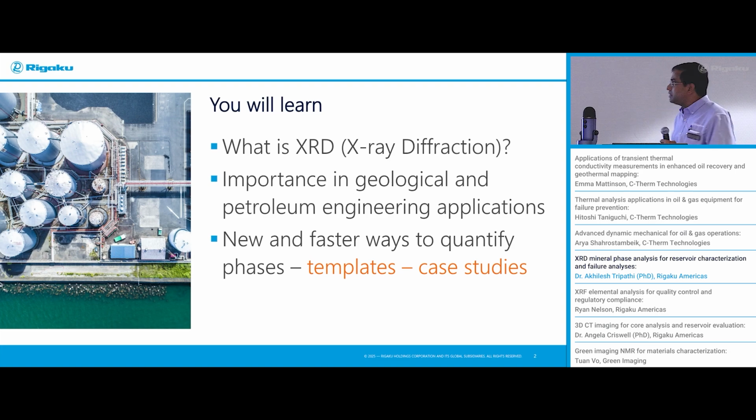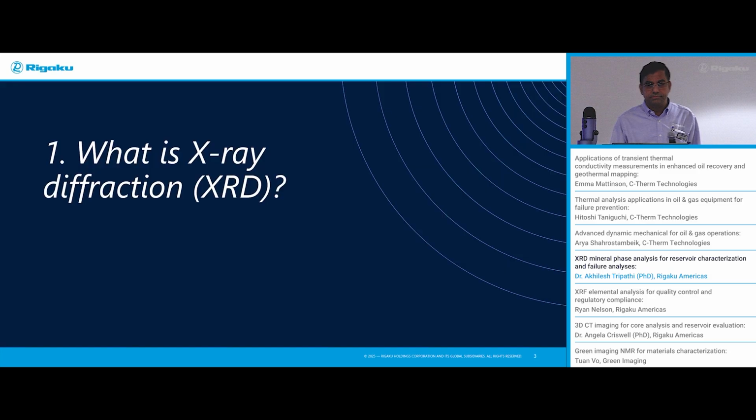What you will learn in this presentation, I have divided into three subtopics. A brief introduction of what is XRD. I know most of you are aware here, but let's just touch the base. Importance in geological and petroleum engineering applications. And something I want to touch today is the improvements, new and faster ways to quantify phases. We'll see the use of templates, and we'll do a case study on that.